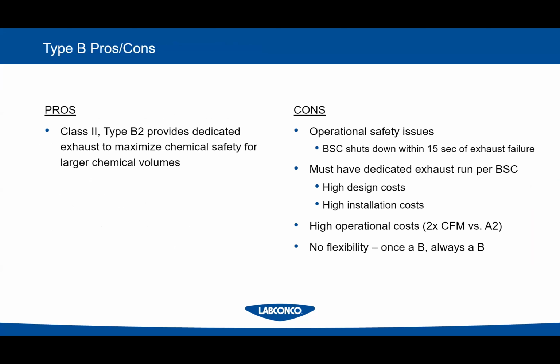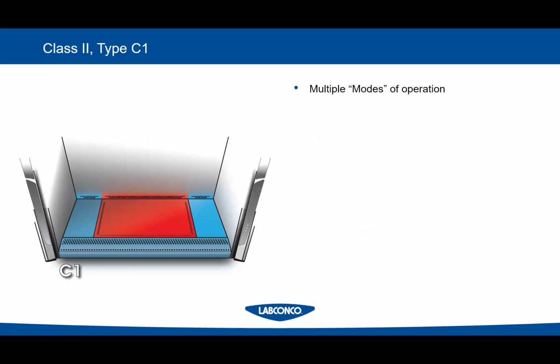So the pros of this type of cabinet are it can handle a large volume of chemicals. Not all chemicals. Remember, these are stainless steel cabinets. Nobody's handling any strong acids in this cabinet. Again, they're probably working with cells, right? Which are not going to tolerate any of that. So most of the things that are worked with in these hoods are solvents, phenol chloroform for molecular biology use, things like that. Okay, so it's kind of where we're going there.